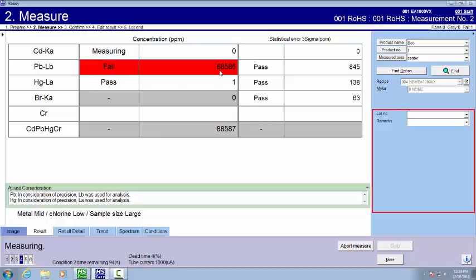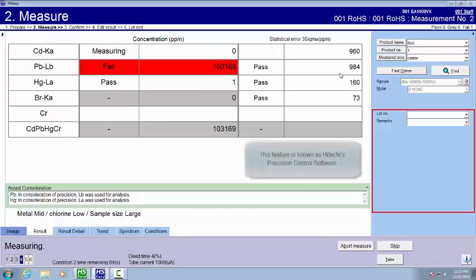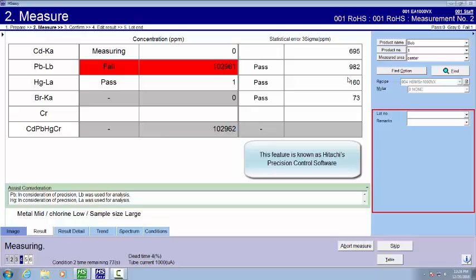We're going to end the measurement time quickly. And how we do that is by the statistical error. When creating this recipe, you decide how much error you can accept. And once the error gets down to a certain level, in other words, you become accurate enough, there's no reason to go on and we'll just end the measurement time for the lead.